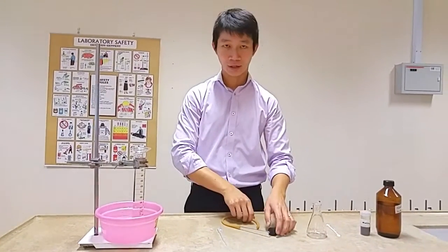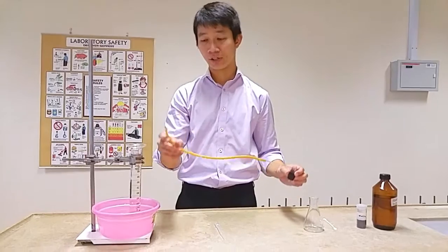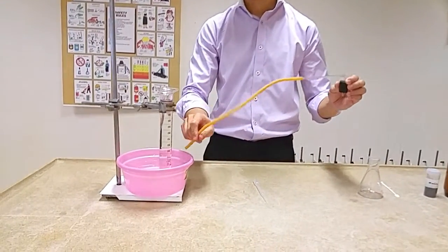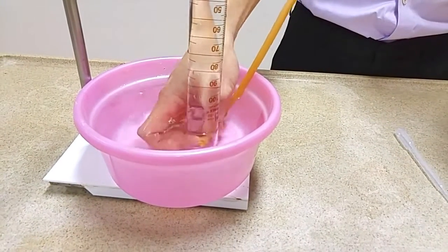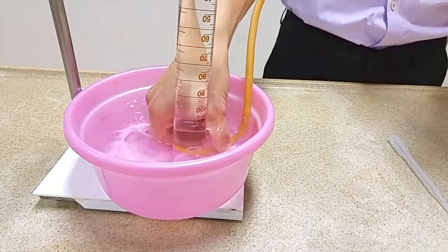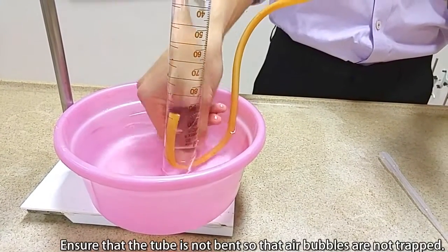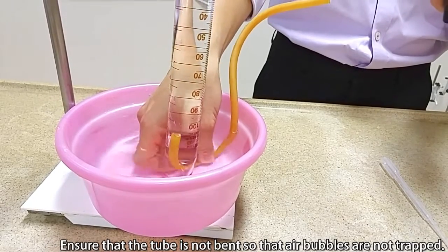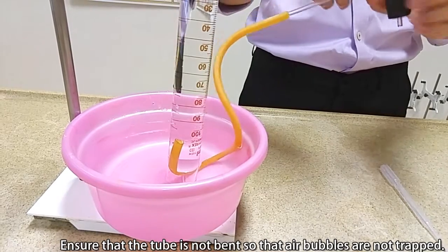After this is done, insert the delivery tube into the measuring cylinder. Make sure that the delivery tube is sufficiently inserted into the measuring cylinder such that it will not come out in the middle of a gas collection experiment.